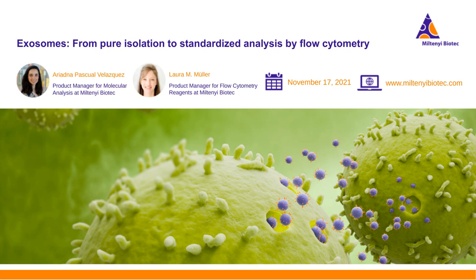Thank you very much. And again, I want to thank our audience for these great questions coming in. Our next audience member says, thank you very much for this informative talk. I'd like to know if it is possible to isolate exosomes from the supernatant of fibroblast cell culture.